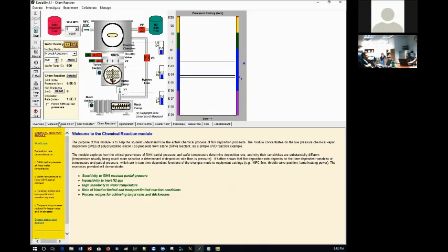So what I mean is, if I were to increase the temperature still to 700, I don't think it would change drastically. Yeah, it didn't change even if I increase it to 700, as you can see. So it needs more pressure. Let's give 10 SCCM, and then it jumps to 1.5 times 10 to the minus 2, as you can see.